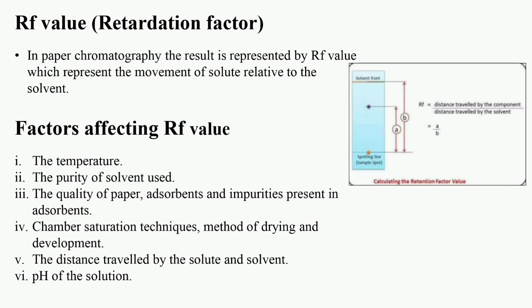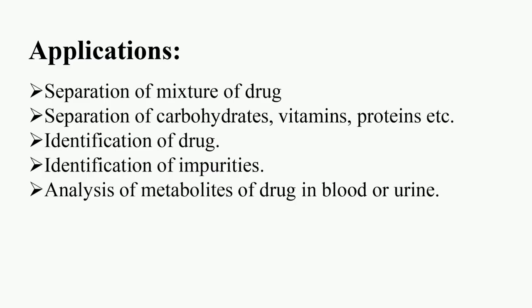pH of the solution. Applications. Separation of mixture of drug. Separation of carbohydrates, vitamins, proteins etc. Identification of drug. Identification of impurities. Analysis of metabolites of drug in blood or urine.